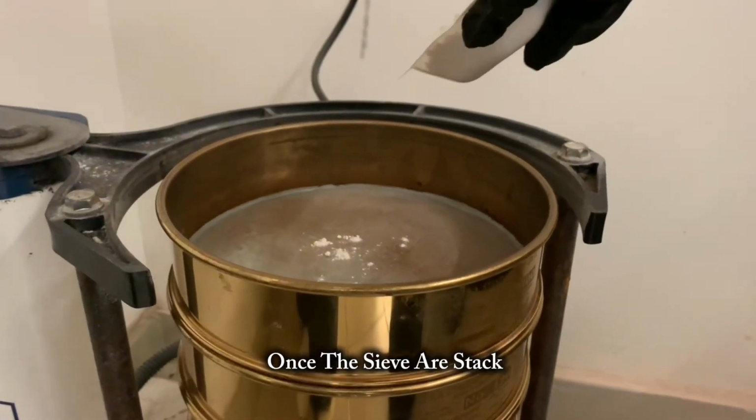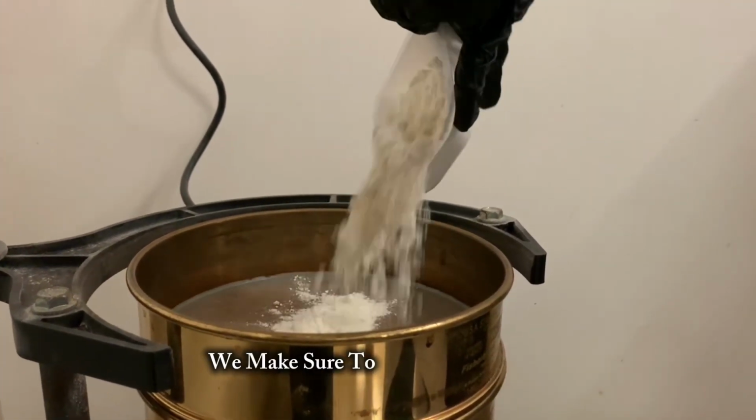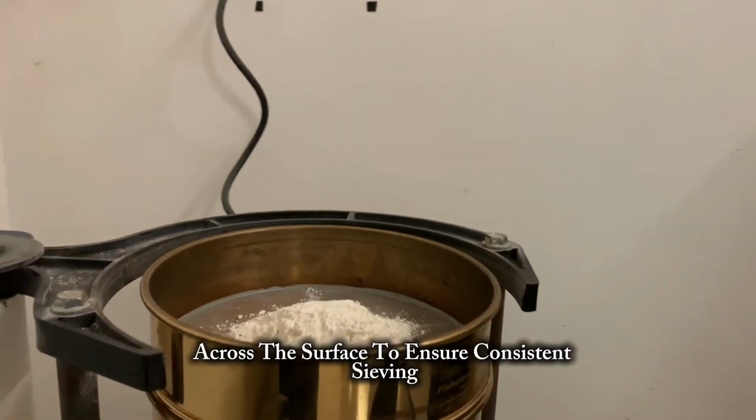Once the sieves are stacked, we gently pour the sample onto the top sieve. We make sure to distribute it evenly across the surface to ensure consistent sieving.